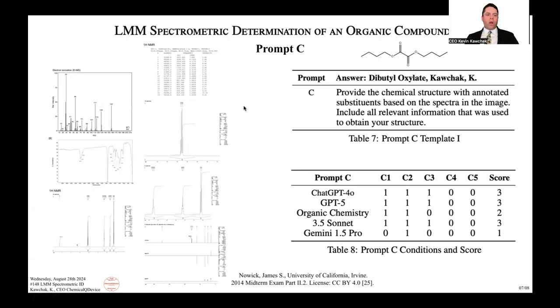Now, for the proton NMR, and again, this is more of an exam problem, less on the real life data with the noise and the impurities from the last sets of data, basically it has this proton NMR. The tricky thing about this one is that I kind of picked off from the proton NMR. So instead of being 2 to 2 to 2 to 3, with these CH2s and the CH3, it was coming up as 4 to 4 to 4 to 6. And I remember something like that from grad school. I was like, this has to have symmetry in it. Okay. So I haven't checked with the professor, but I'm pretty sure this is the answer. So that's what kind of set that off.